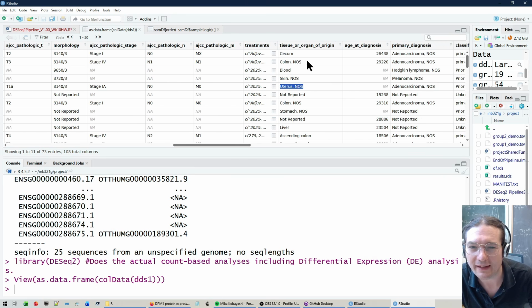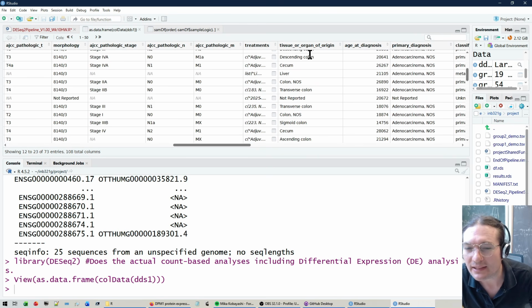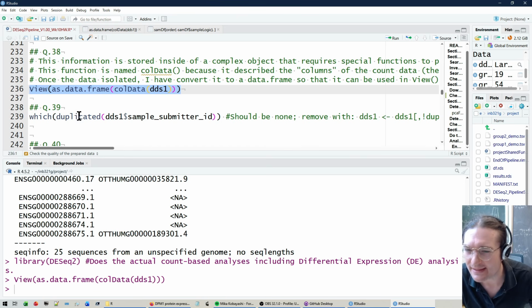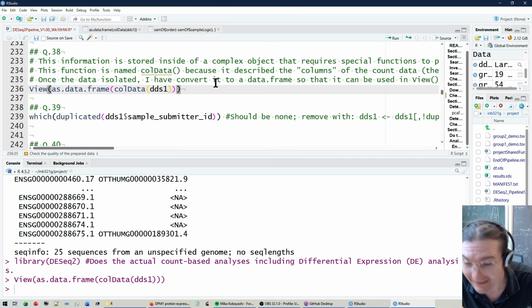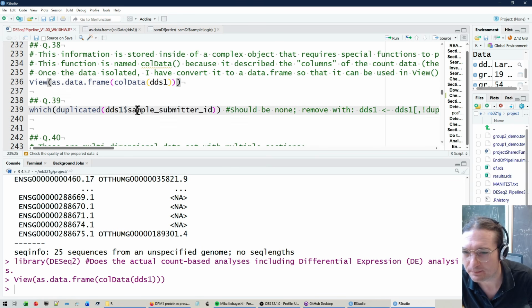These are all colon samples, but I'm getting tissue from all over the body. I believe what's happening is that it's pulling these descriptors from other tissue samples of that same patient. But the data it's downloading is the data I actually requested, which is why I'm not really panicked. I'm only annoyed. But that's what's going on here.